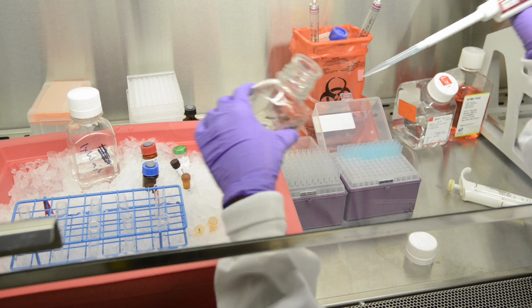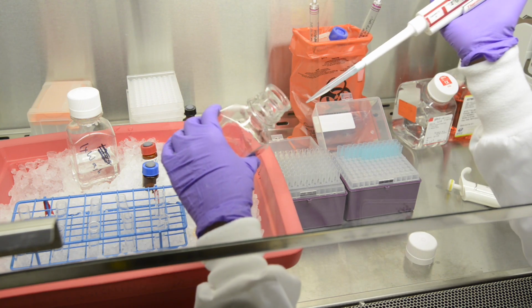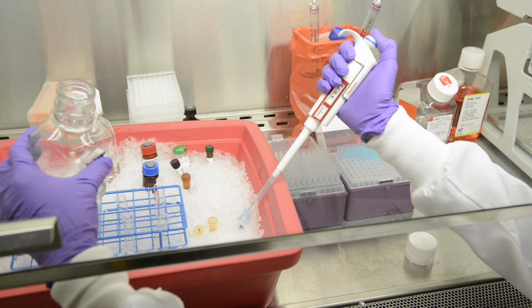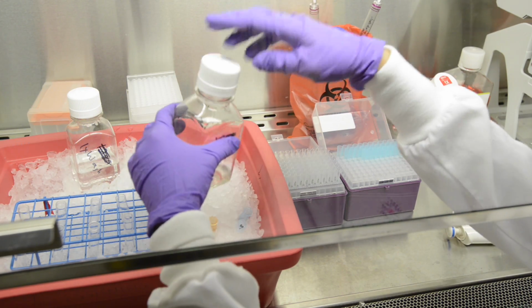Here we prepare the antibody cocktail for staining various cell populations using different combinations of FACS antibodies. Then we add the appropriate volume of the antibody cocktail to each sample and incubate on ice in the dark.